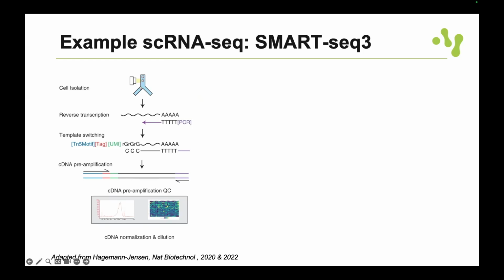Thank you. You had a question as well? Yes, thanks. I was just wondering, what exactly is the benefit of these Tn5 motifs? The Tn5 motif in the 5' end of the SMART 3 was a small trick to be sure that the Tn5 cuts there and adds the tag there, because it's to the left of the UMI.